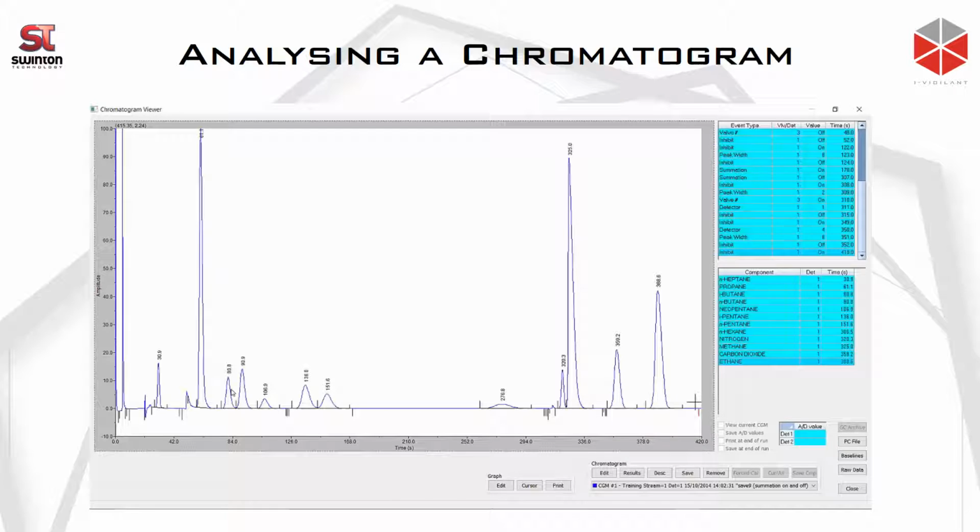And then what happened after that, we also have the nitrogen peak. Apologize, move back a little bit. So we got inhibit on over here, and we got all the events there. We got inhibit off again to detect the CO2 event. So basically, all the events that are not peaks will need to happen between inhibit on and inhibit off.